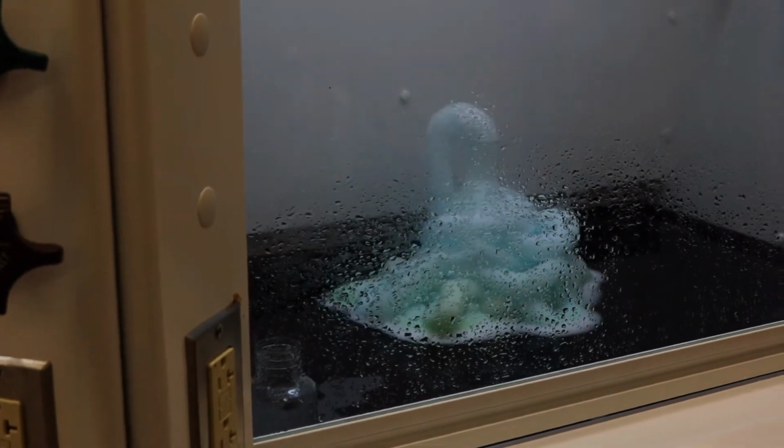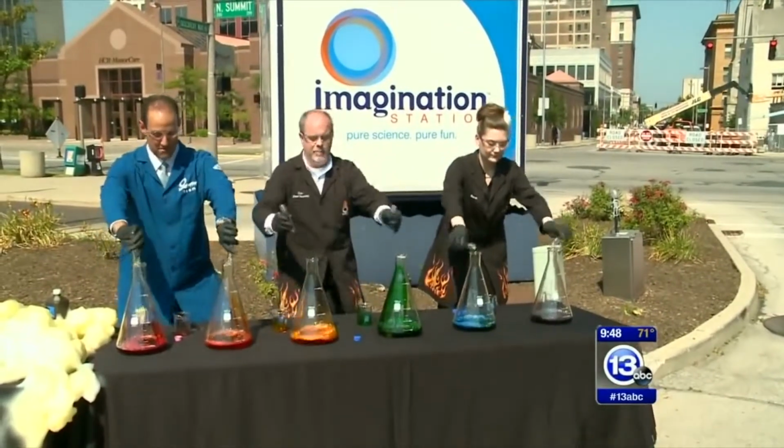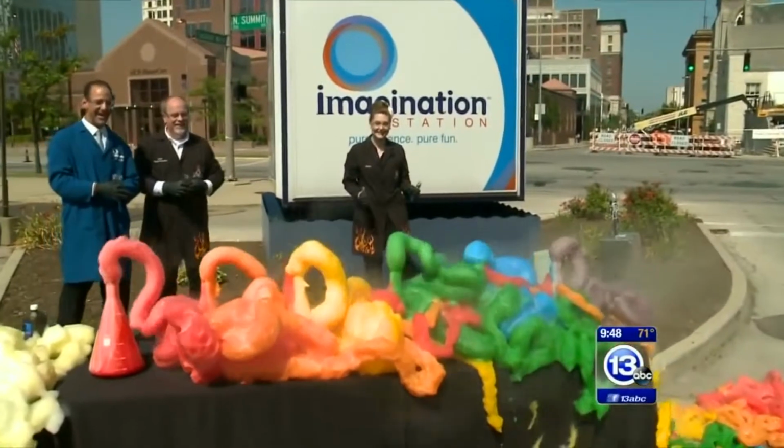The reaction produces oxygen gas, water, and iodine. As the reaction takes place, you'll also see steam rising from the erupting foam. This shows that the reaction is exothermic, meaning that it gives off heat. It is an exothermic as well as a decomposition reaction since it shows the catalyzed decomposition of hydrogen peroxide.